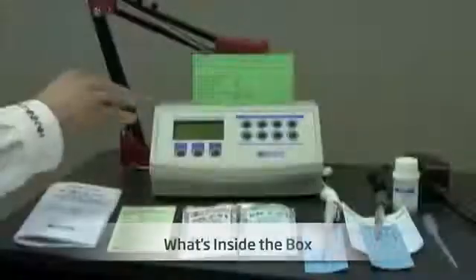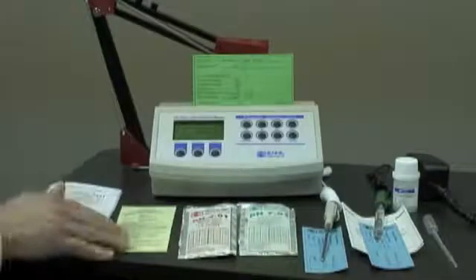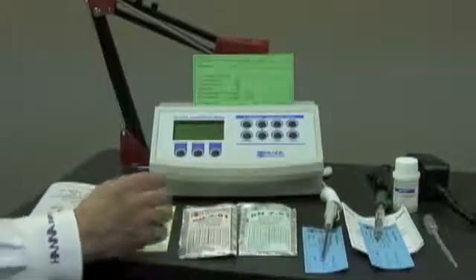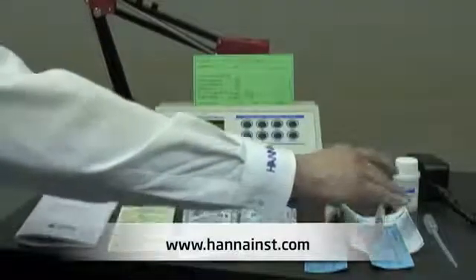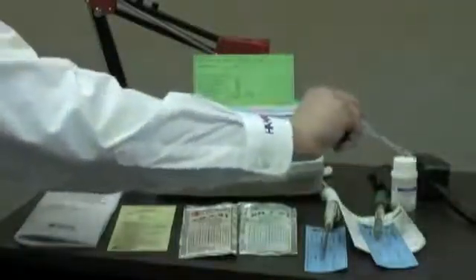Let me show you what's in the box when you receive any one of these meters: the meter itself along with its calibration certificate from the factory, a probe holder, the directions, a quick reference guide, two packages of buffer solution and cleaning solution, a temperature probe with its factory testing certificate, a pH electrode with its factory testing certificate, the electrode instruction guides, solution to refill the electrode as required, a pipette to perform that task, and the power cord.